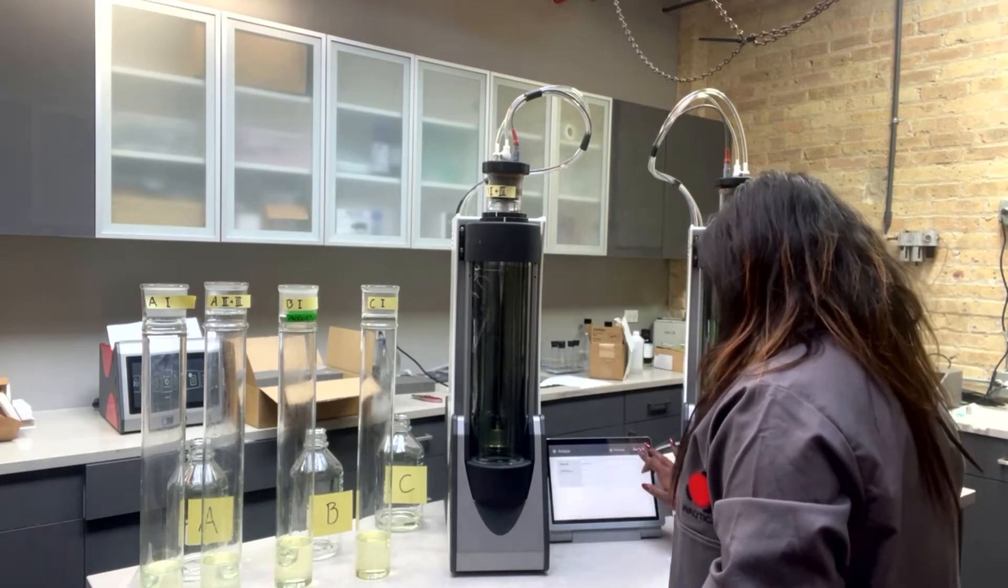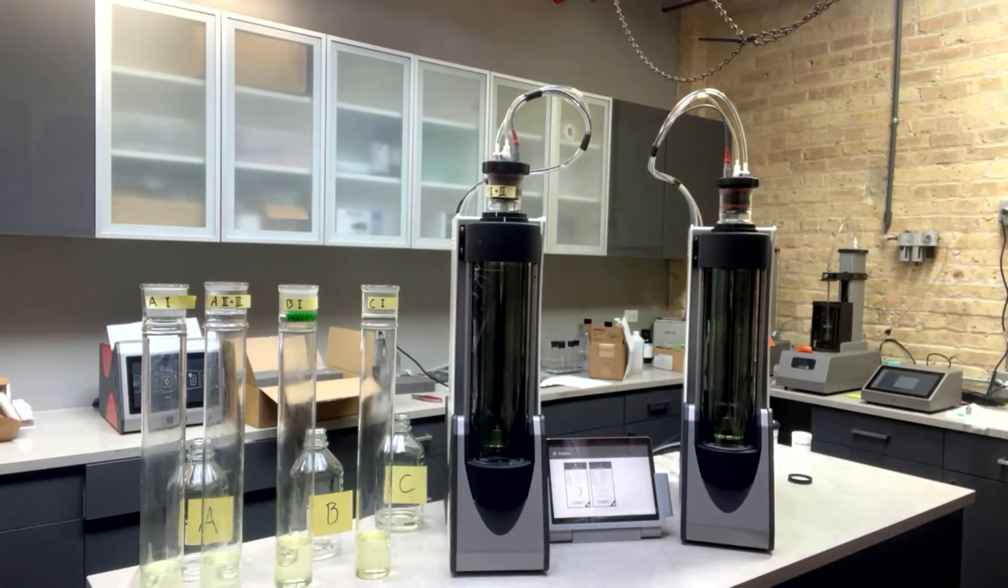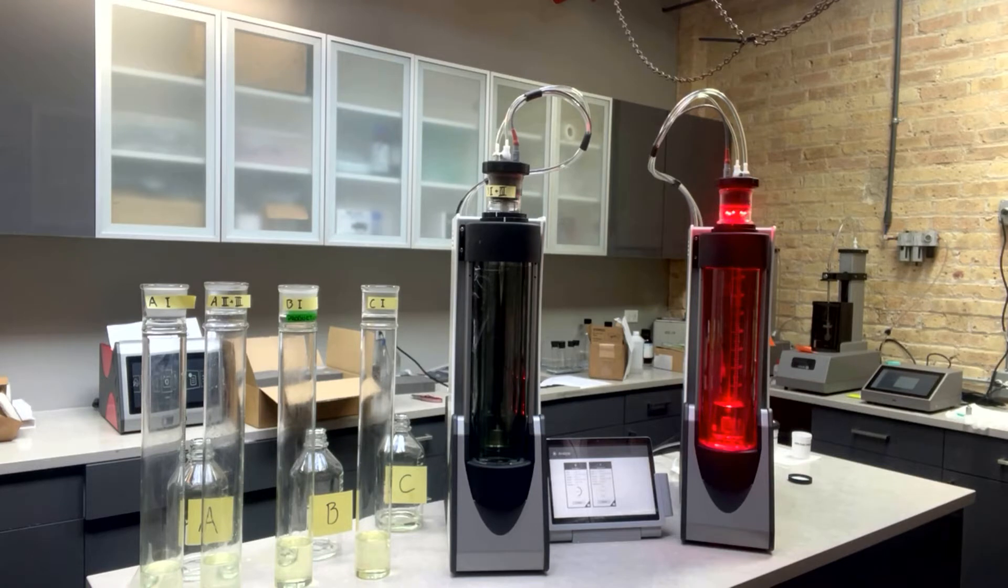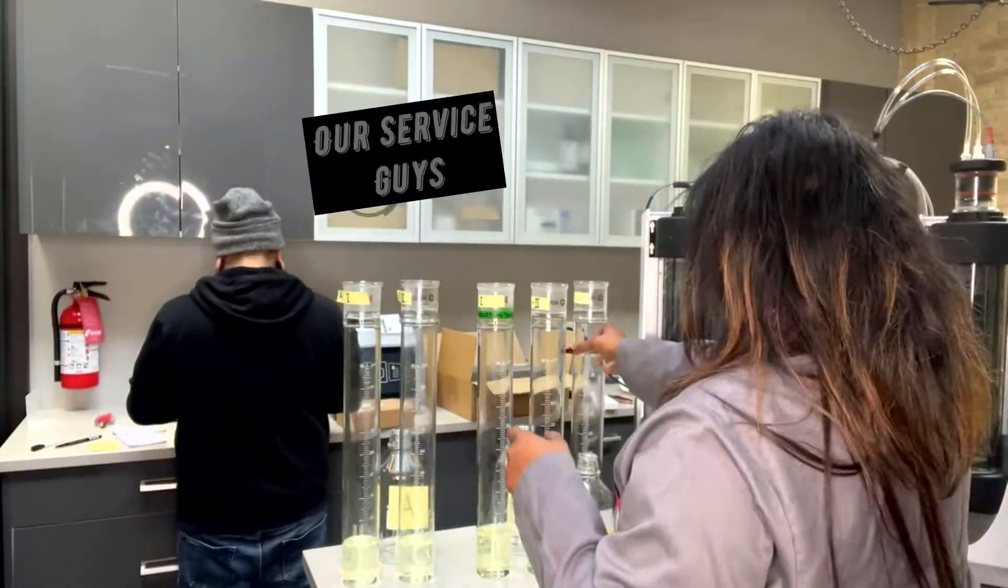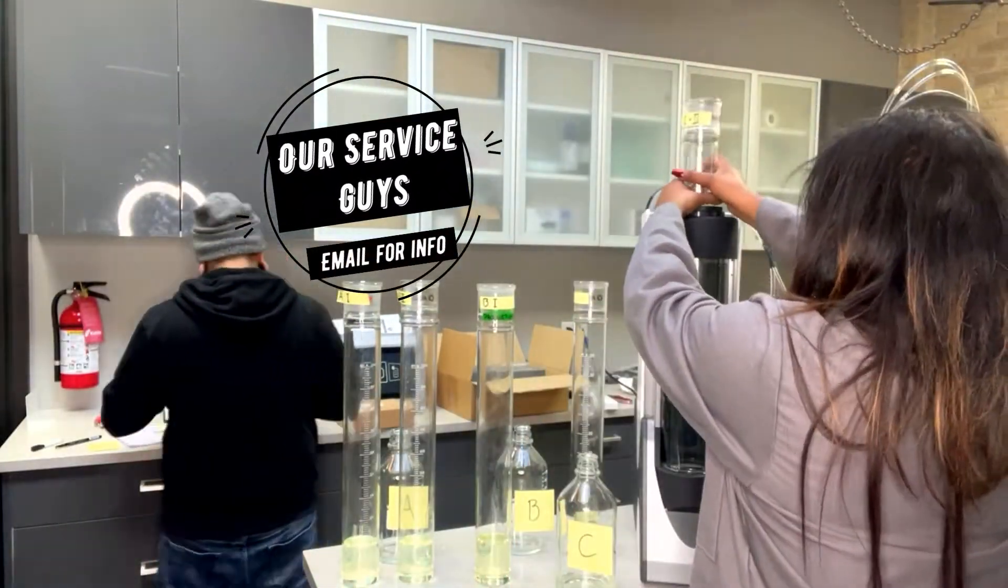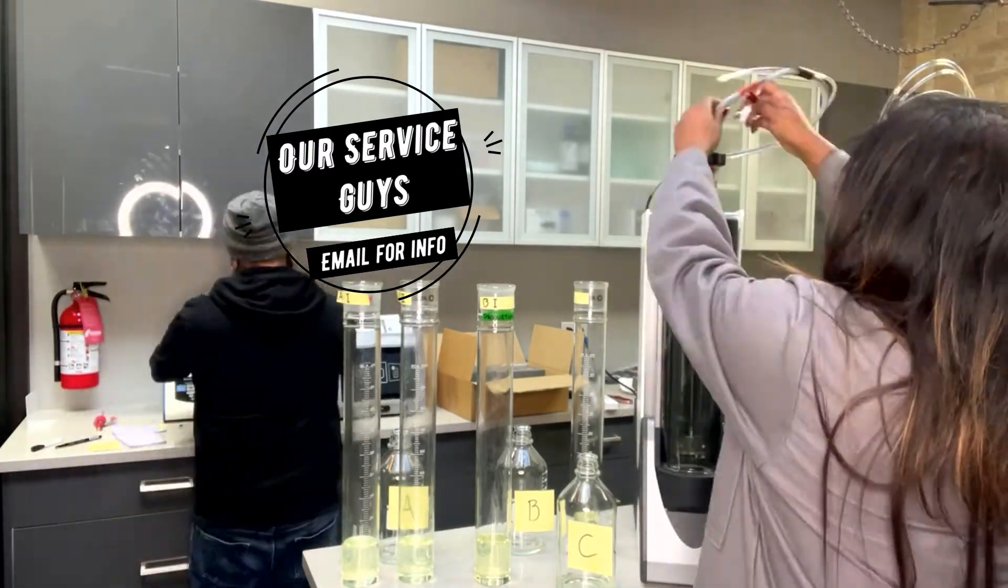With traditional systems you need to manually extract the sample out of the bath with the hot dripping oils and insert it into the second bath at lower temperature. This requires not only manpower but precious bench space.